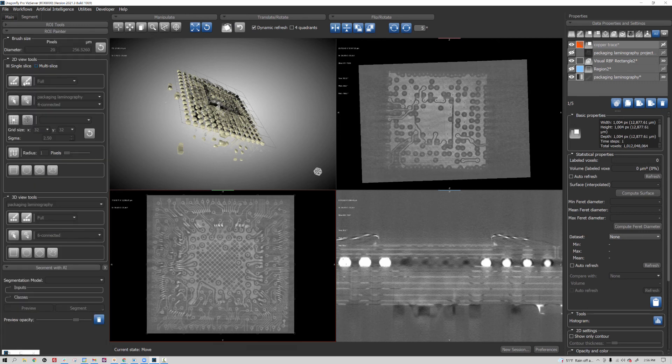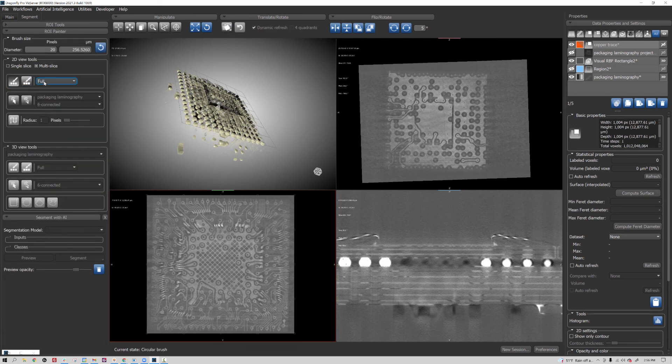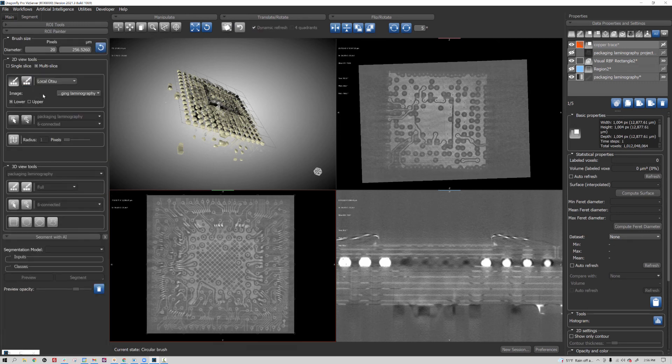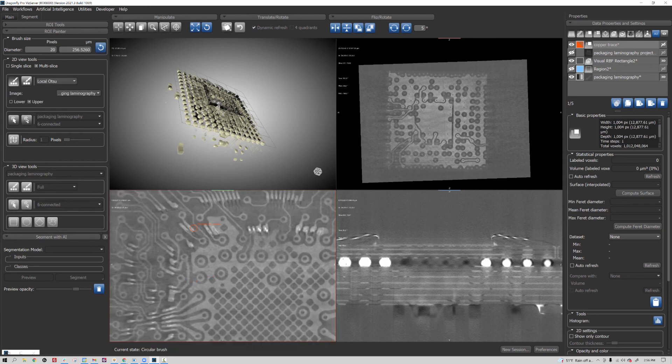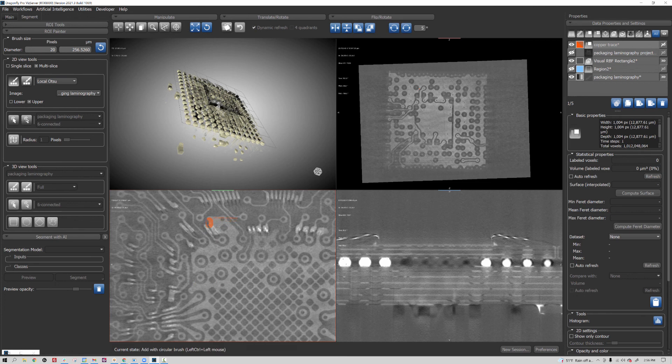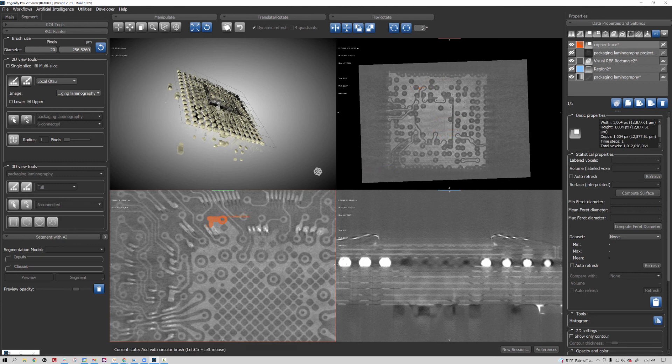So I'll choose a multi-slice local Otsu and tell it I want to pick the brighter pixels here, and I can start painting this. Now I'm painting in the non-planar view, but you will see the paint appear on the cross section because it's actually mapping it back to the original three-dimensional Cartesian coordinate system.